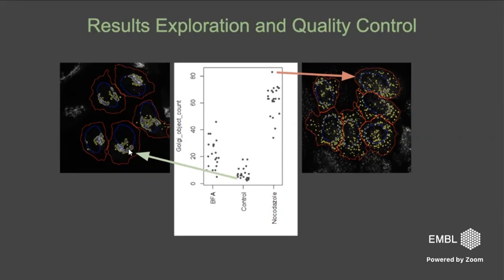So actually, it's really worth spending a lot of time also generating these images, right? Like you have the intensity image overlaid with clearly nice outlines of the segmentations and so on. So I usually spend a lot of time trying to produce high quality images that are easy to inspect later. And also we spend quite some time developing software where you have these sort of plots and you can click and you can see the images. So this is really important in practice, otherwise you just don't know what you're doing.